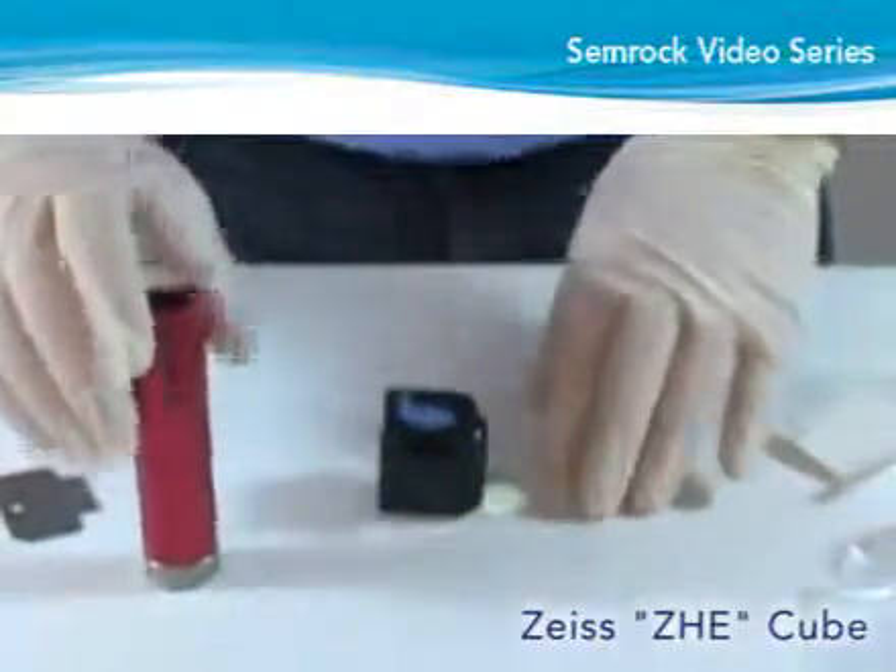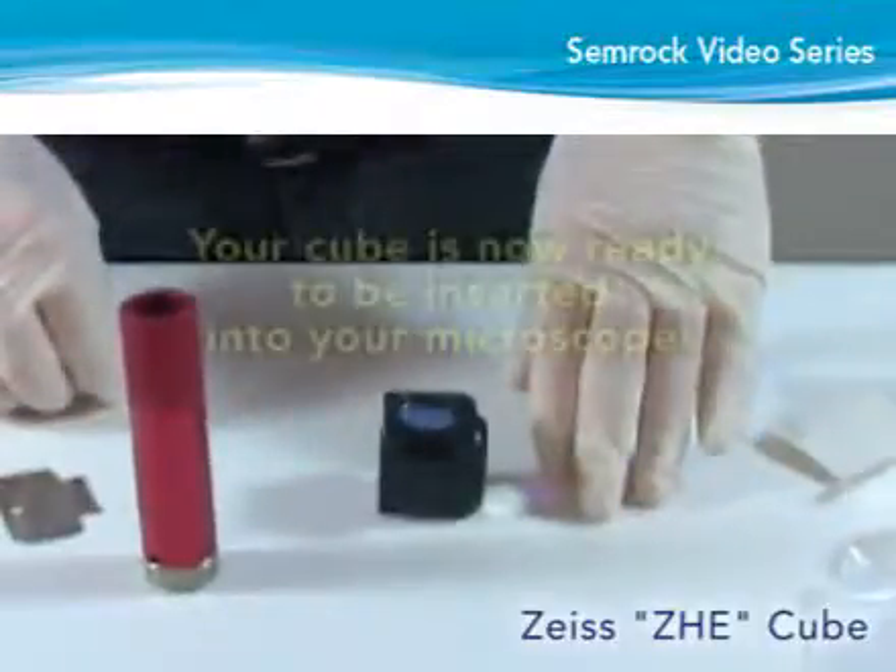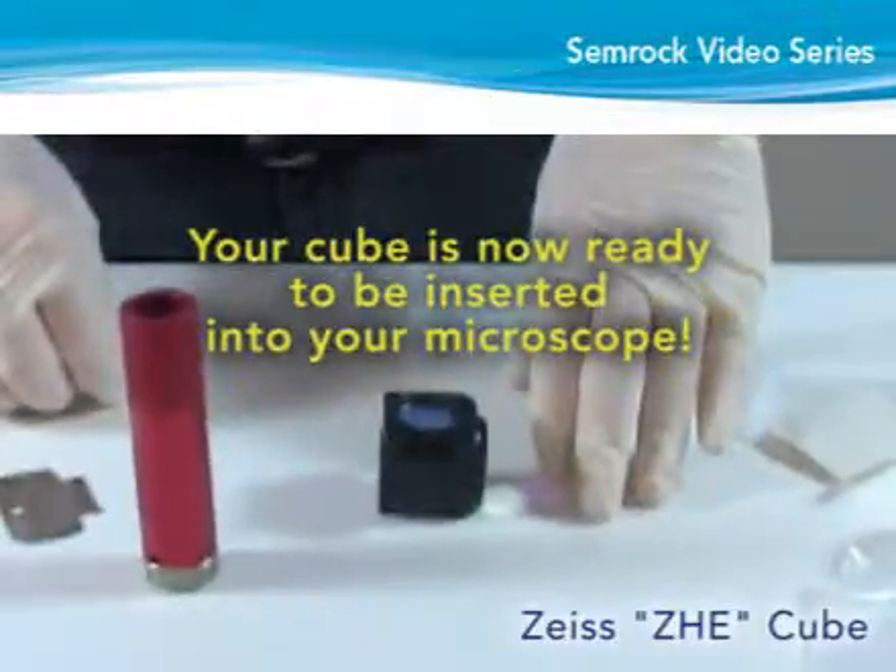Using compressed air, blow off all of the exposed filter surfaces. Your cube is now ready to be inserted into your microscope.